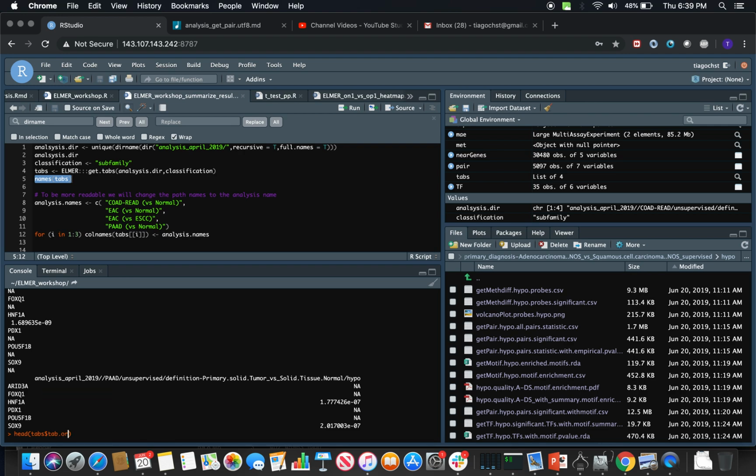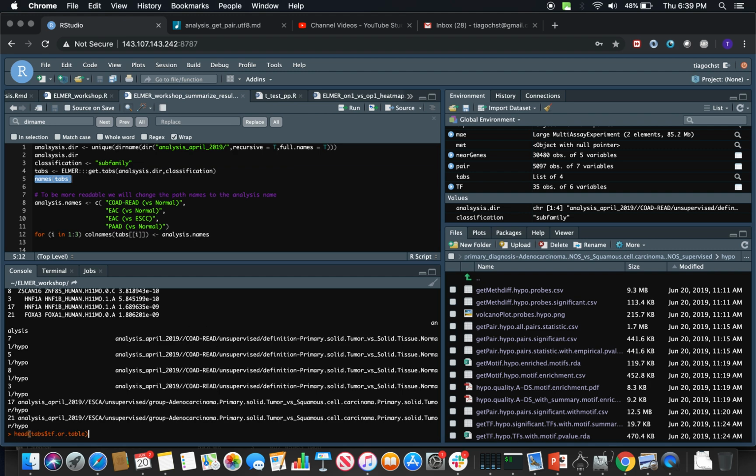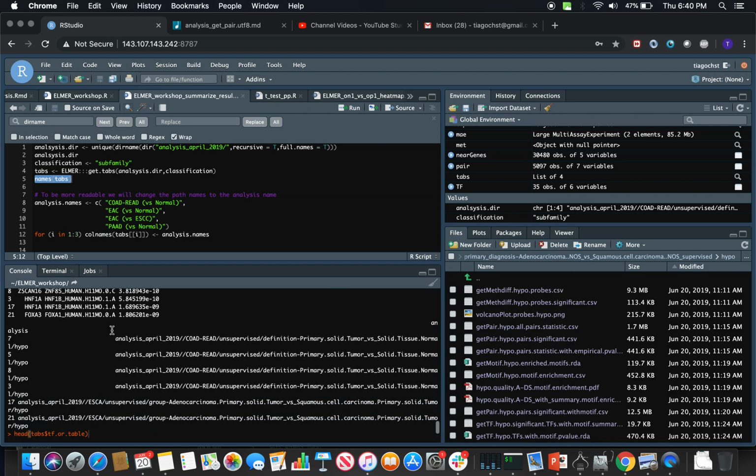We have also the odds ratio between that TF and in the analysis. Basically, the enriched motif in which that TF was identified, we simply get the highest odds ratio, and we put in this table. And the last one is the transcription factor odds ratio table. So it's going to give you the transcription factor, which is the motif it's binding, in the FDR between them. So it's another way we summarize the table. It's going to be used later for plotting purpose.